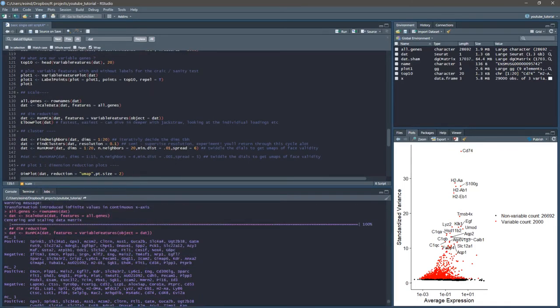You can look through each of your principal components and pull out the loadings if you want. There's going to be a point shortly where you'll need to decide how many dimensions you're going to take forward into subsequent dimensionality reduction, so how many principal components you'd like to feed into your other analyses.